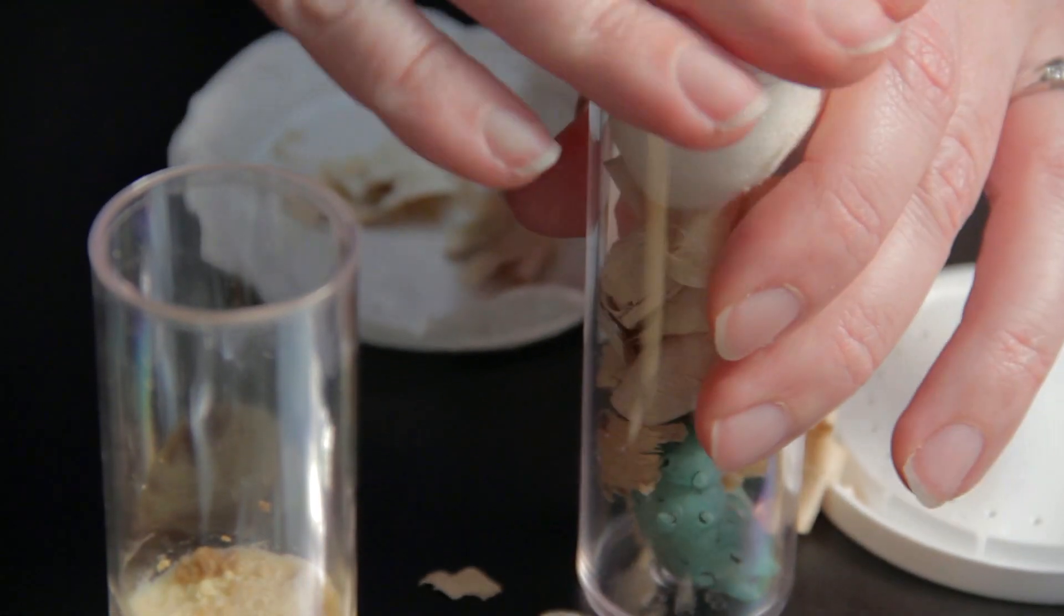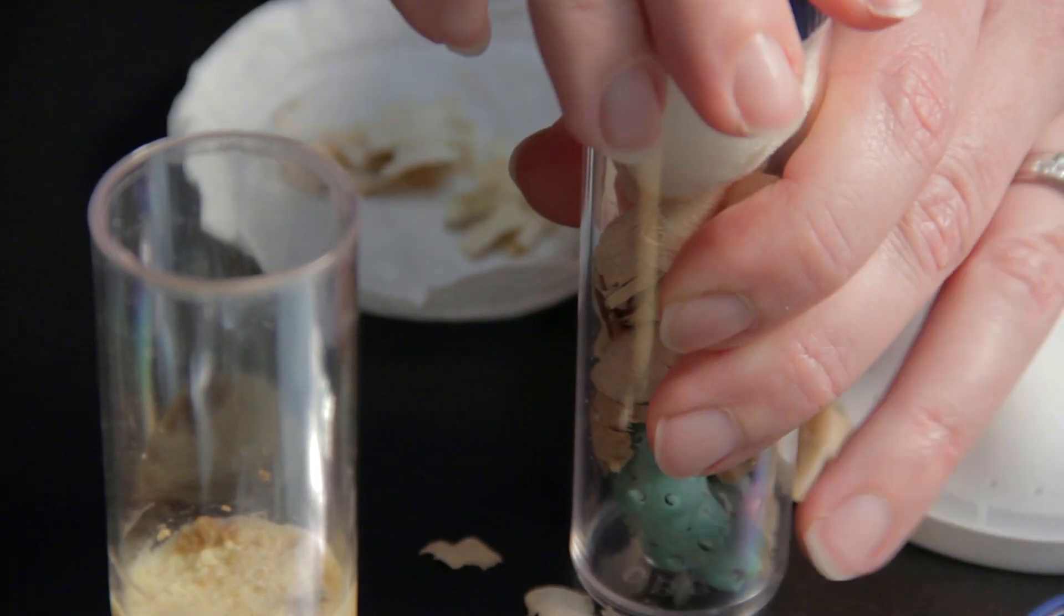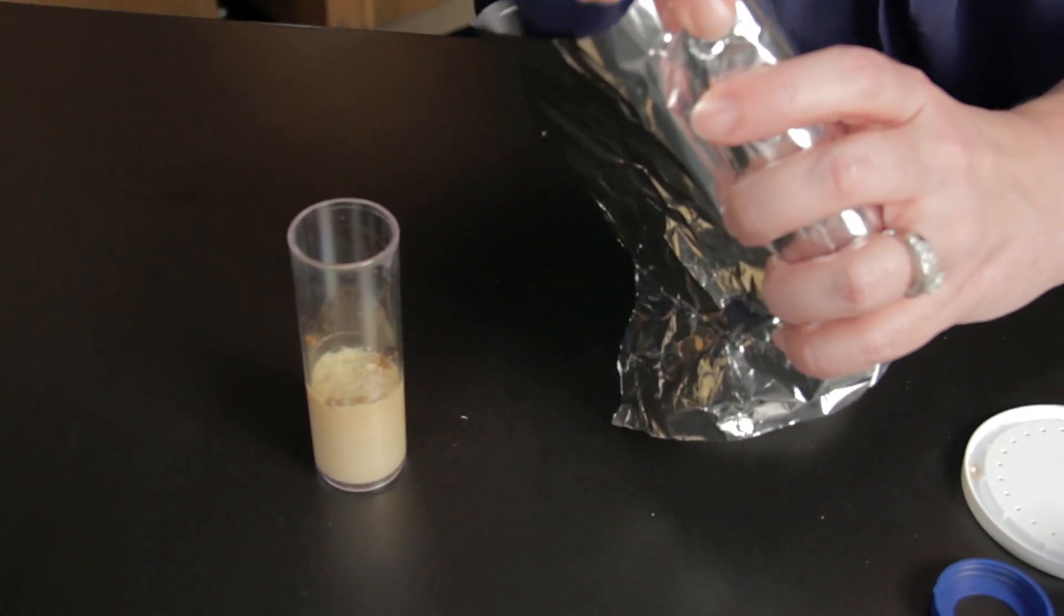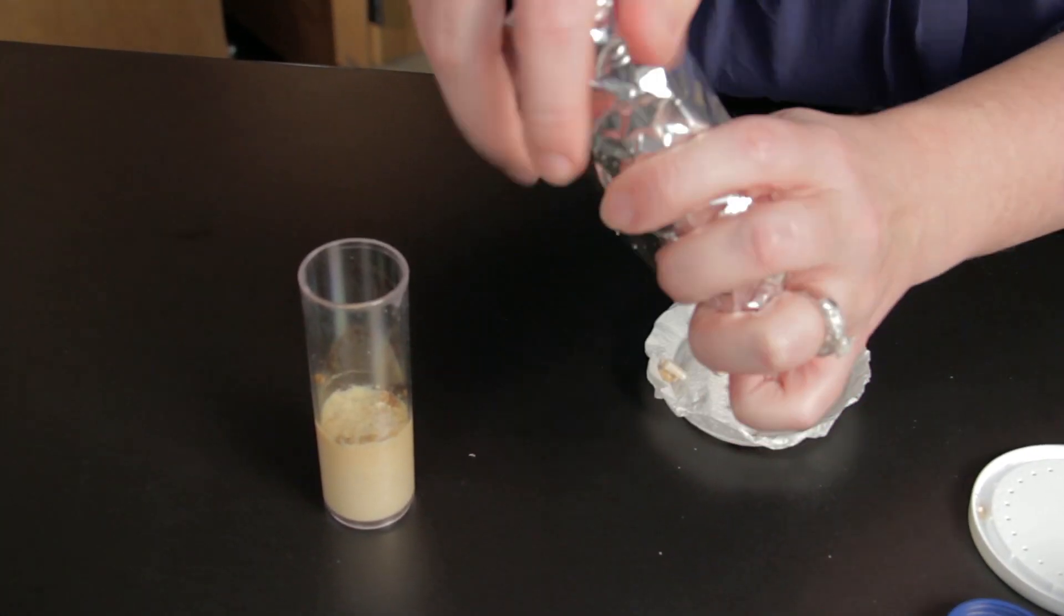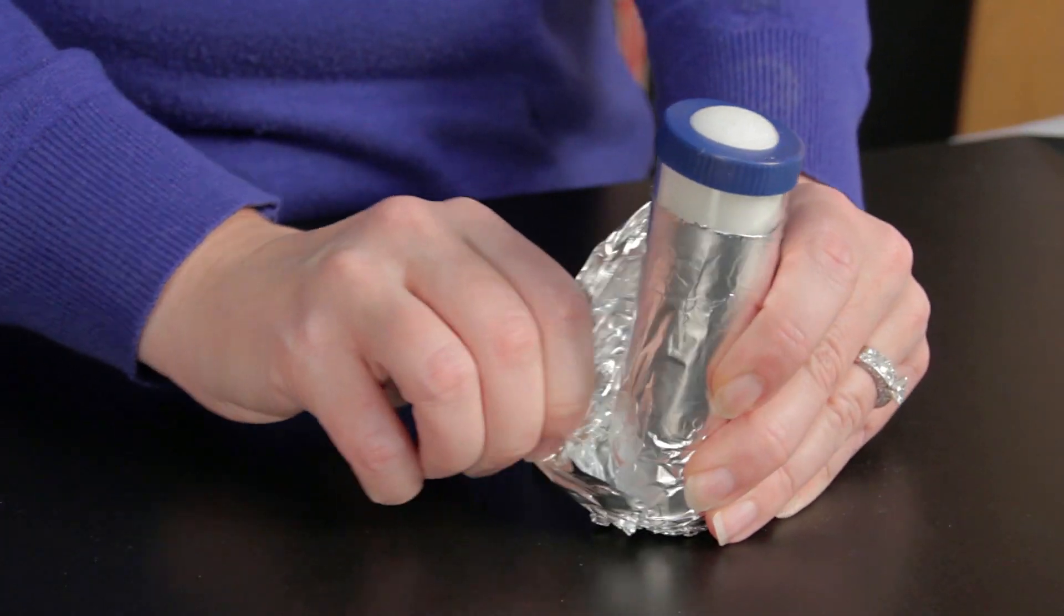Next, wrap the vial in newspaper or foil to provide the larvae complete darkness so it can pupate. Pupation should be complete in about seven days.